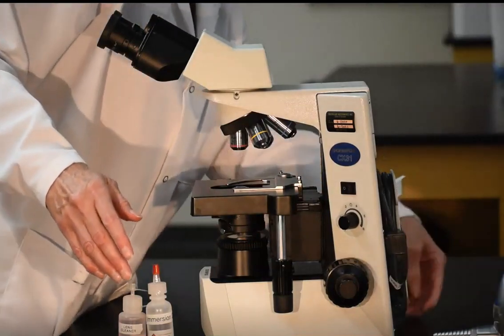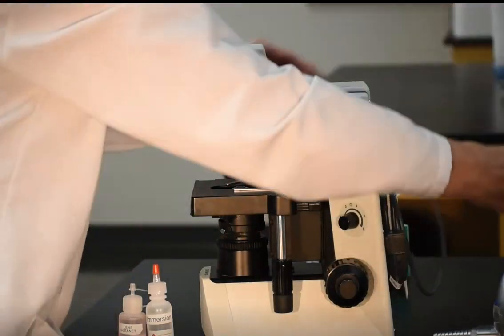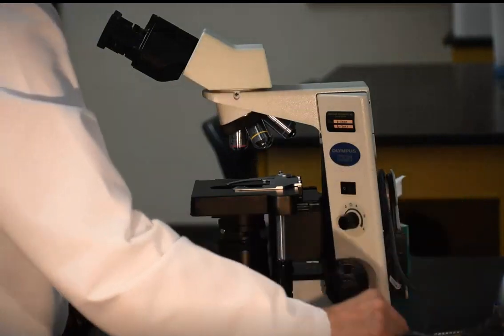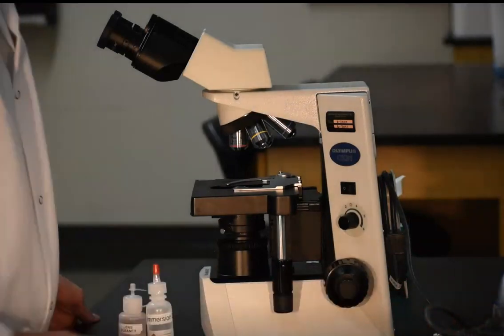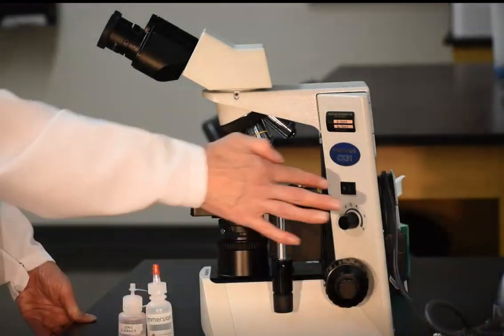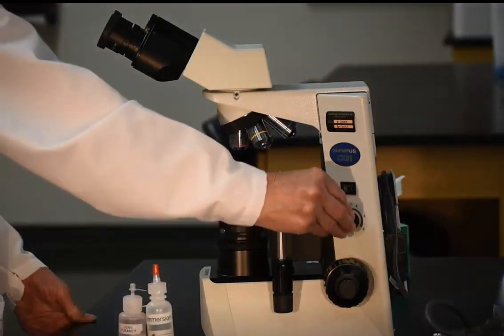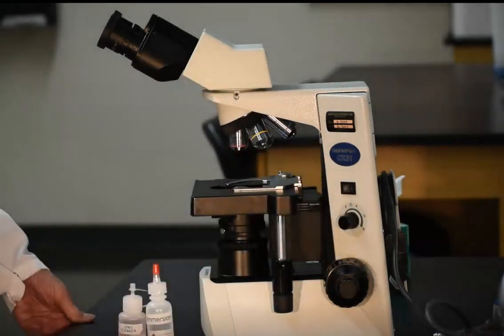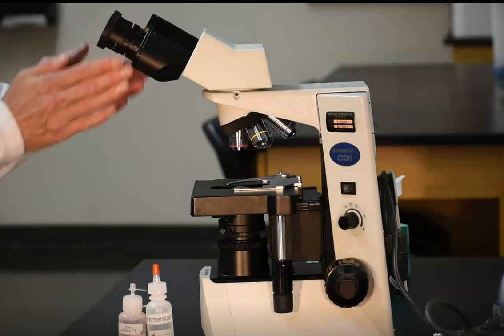Plug your microscope into the electrical outlet and make sure the cord is not going to create a hazard while you're working. It's best for the cord to remain behind the scope with not a lot of excess around the work area. Turn the light switch on and increase the light intensity part way on the rheostat. At this time, you'll adjust the eyepiece distance so it'll be comfortable for your eyes.